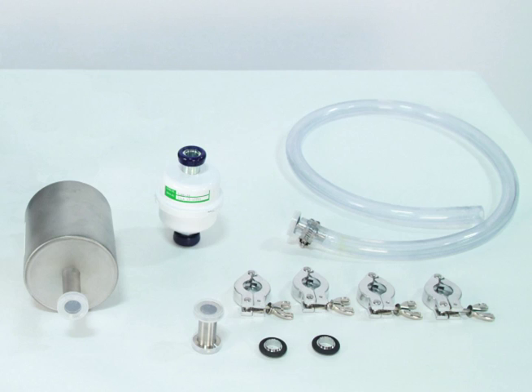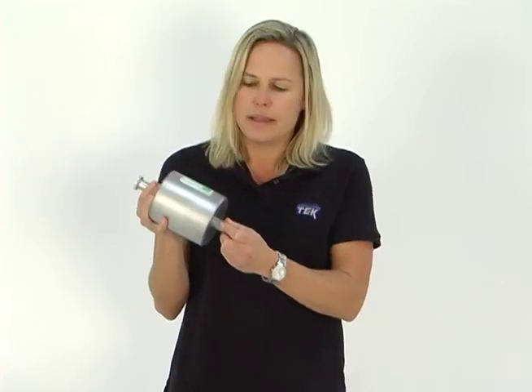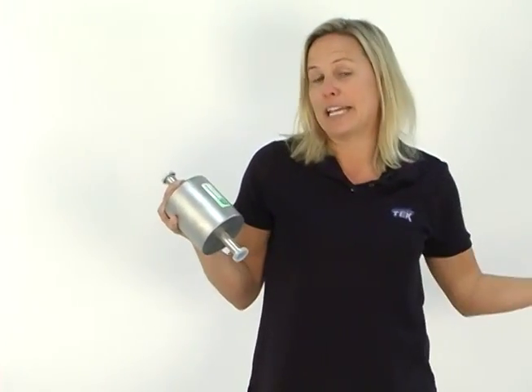First thing we have is this steel cylinder — this is called a foreline trap. What's great about a foreline trap is that it will actually prevent any gunk, oil hydrocarbons, contaminants, from back flowing up through the pump and into your oven and contaminating your parts.